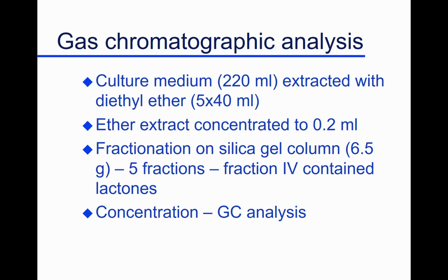It doesn't want to be in the culture medium. It wants to be in that organic solvent. So you basically solvent extract your lactone into diethyl ether. You can go ahead and fractionate that a little bit by column chromatography and then do gas chromatography of it.